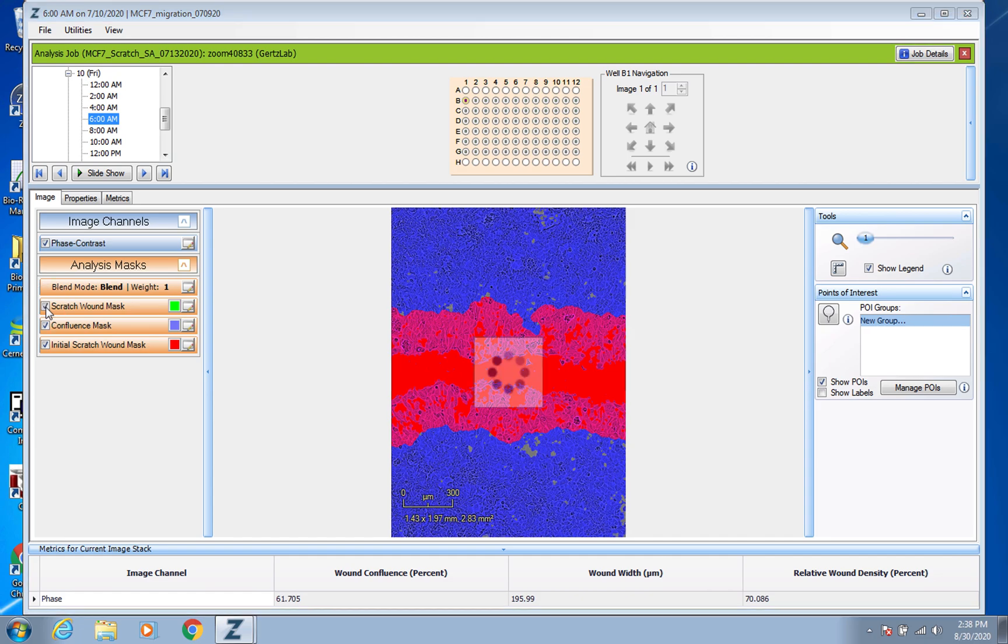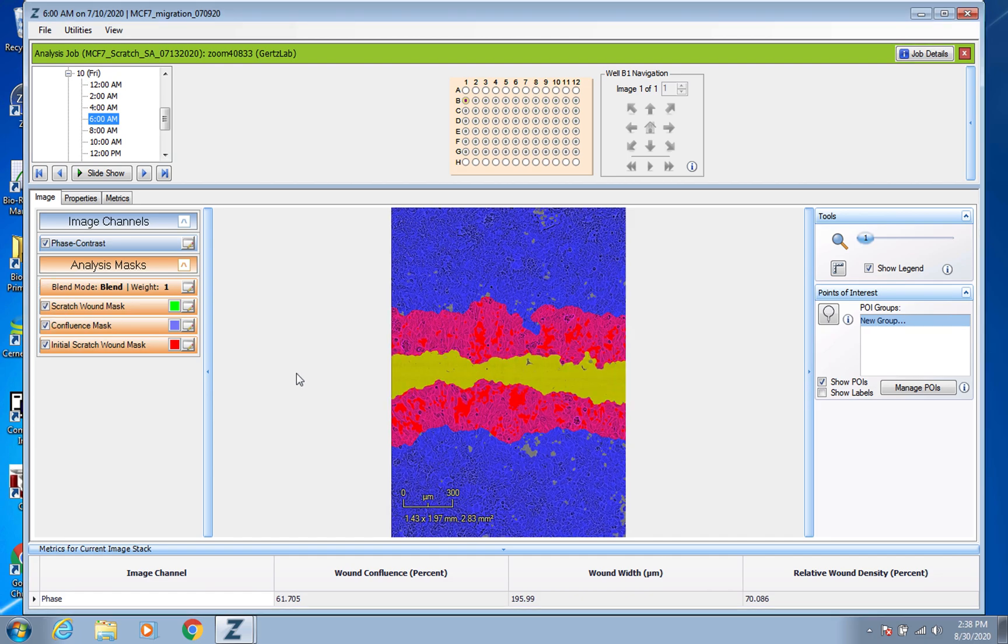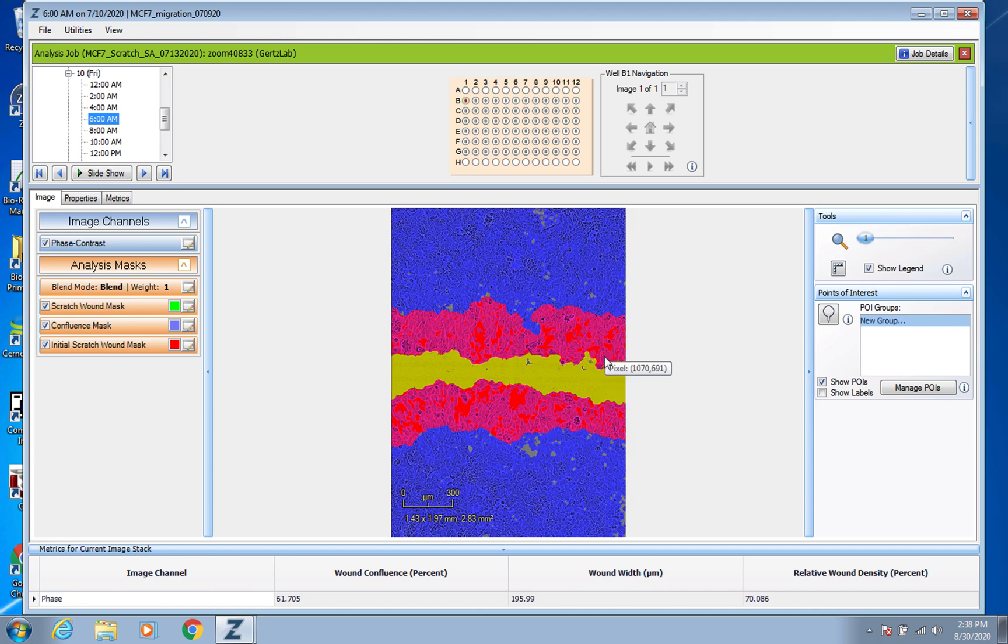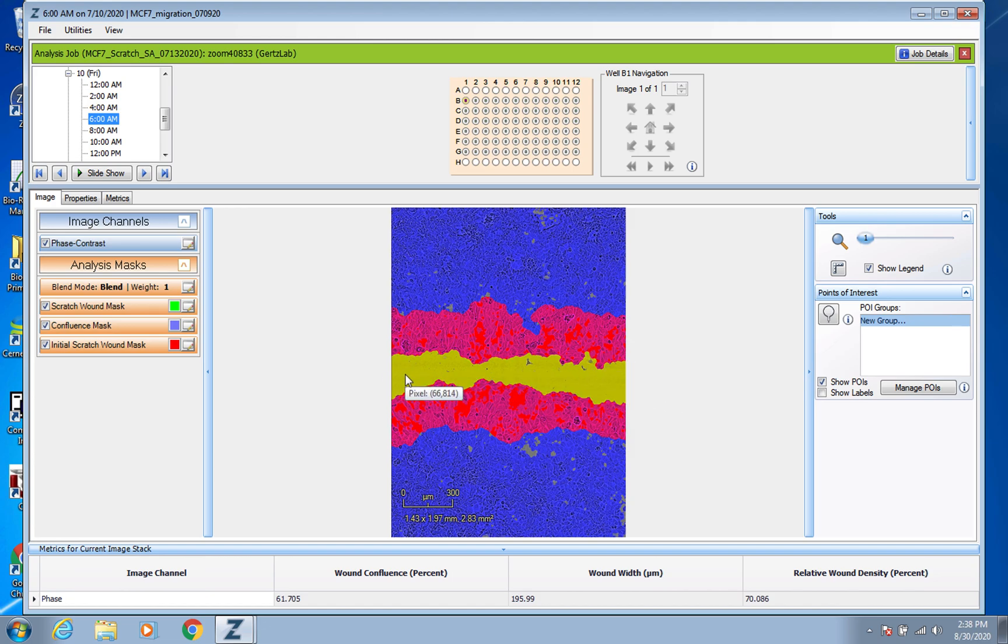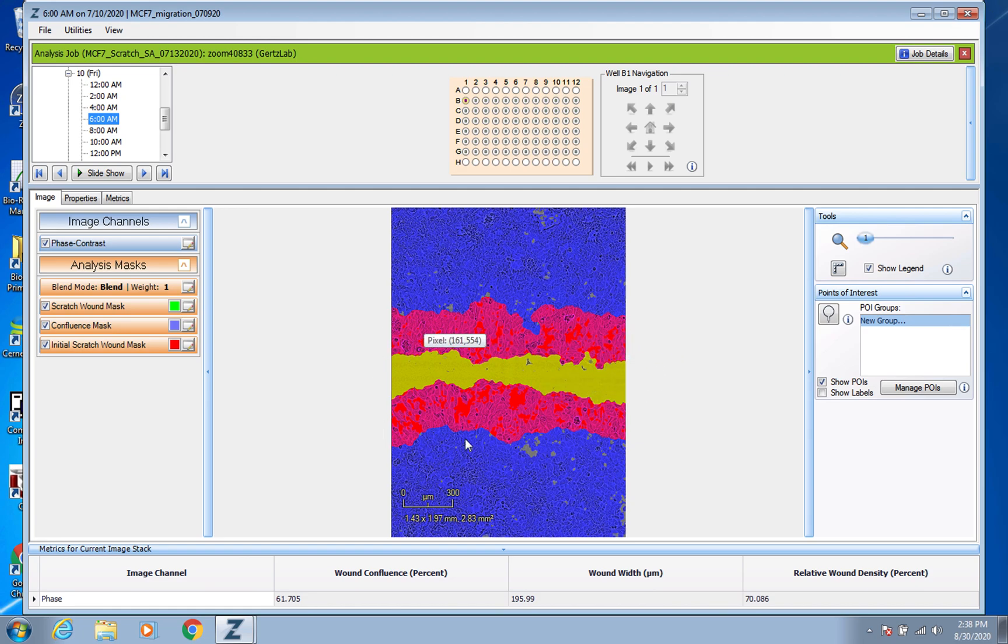So now you have your scratch wound mask and that does change over time. So you can see that the red is still red from where the cells are migrating into the original scratch wound, but the yellowish green color here is indicating what is remaining as far as scratch space and that's how it's sort of slowly calculating this wound confluence.